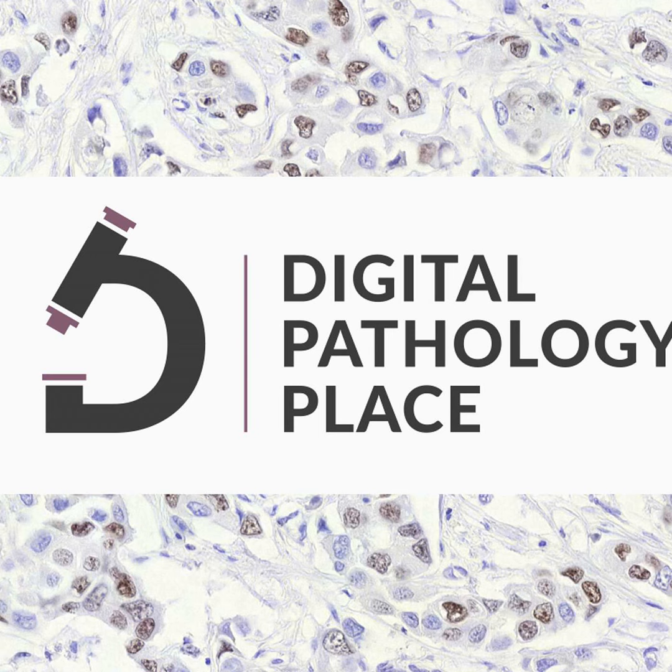That's what I want. So we just need a phone. If we want an adapter to put on the microscope, and then we download the app, right?